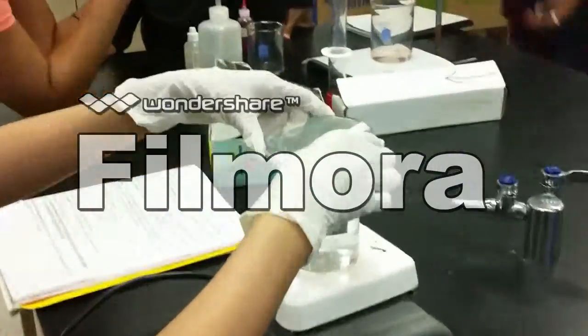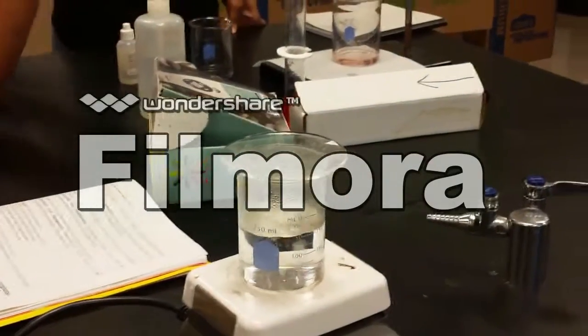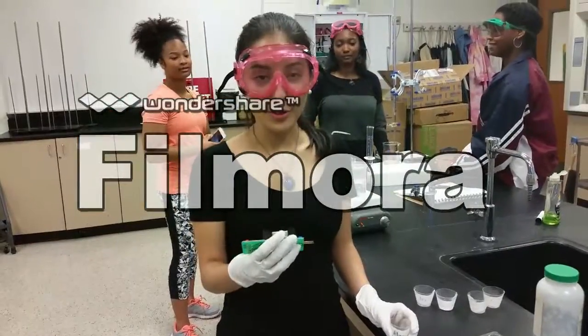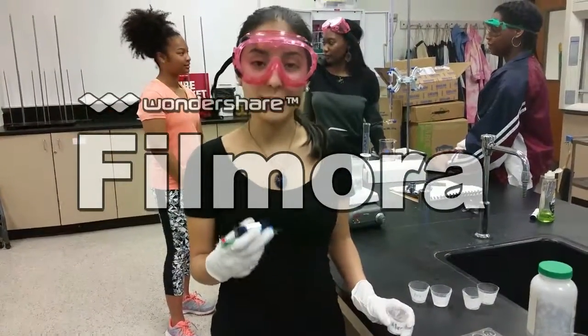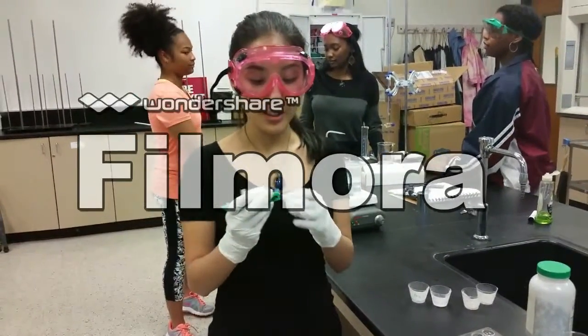Then you would want to put a sample of each solid on the watch glass, and the watch glass will be placed above the boiling water bath. And this will be testing the volatility, so how easily a substance evaporates.